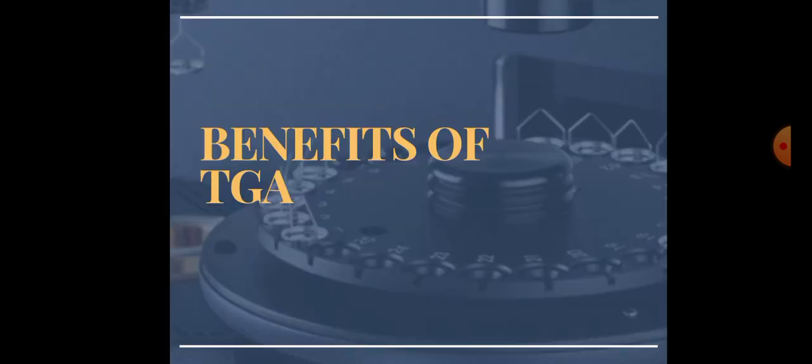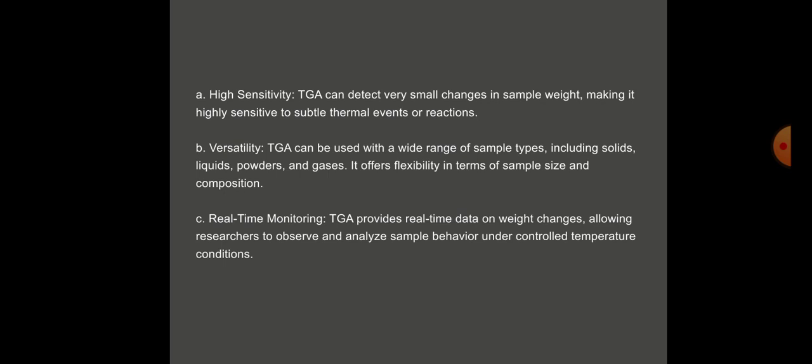Benefits of TGA. High sensitivity. It can provide high sensitivity. TGA can detect very small changes in sample weight, making it highly sensitive to subtle thermal events or reactions.